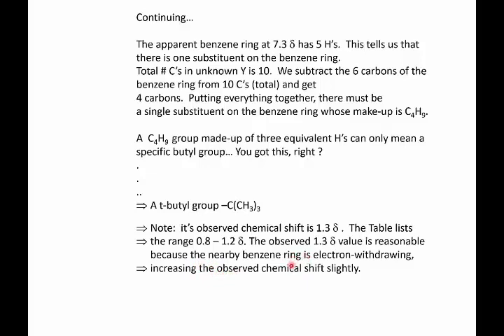So here we go. We have just figured out that unknown Y is tertiary butyl benzene.